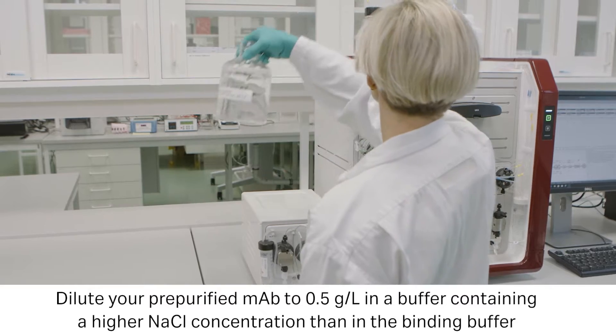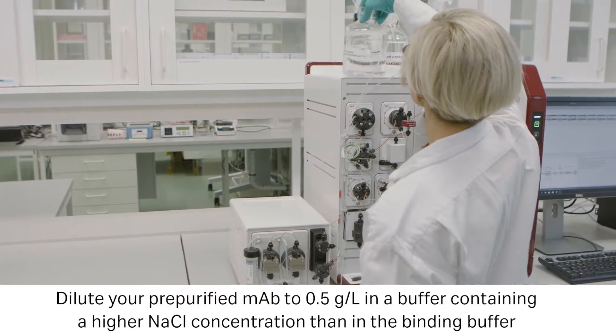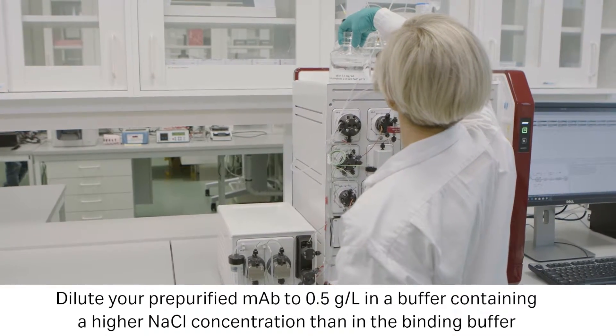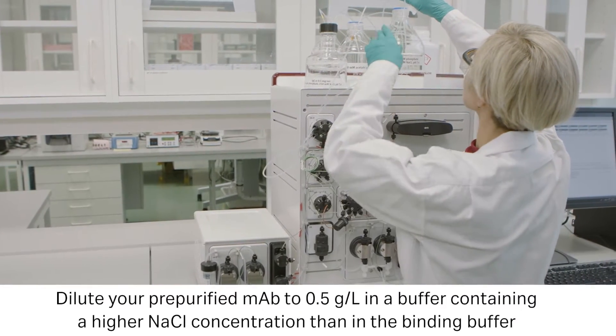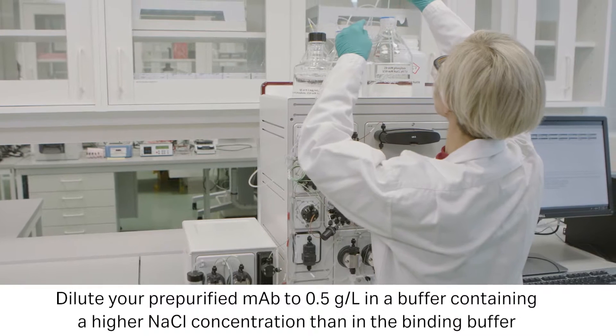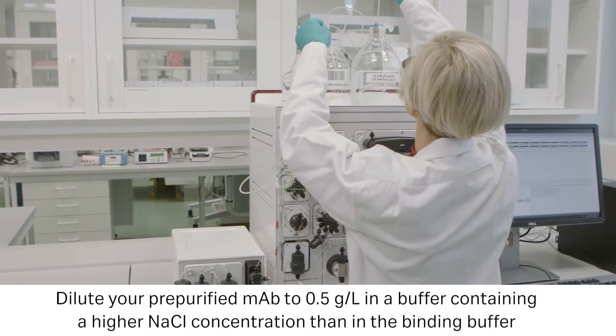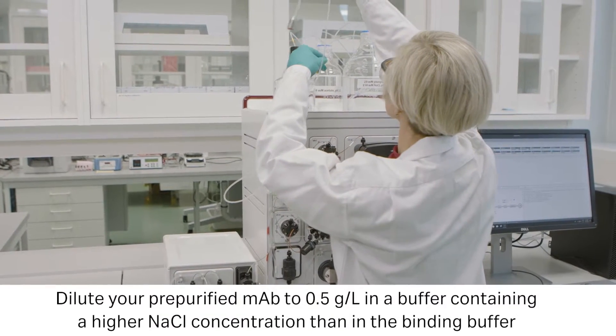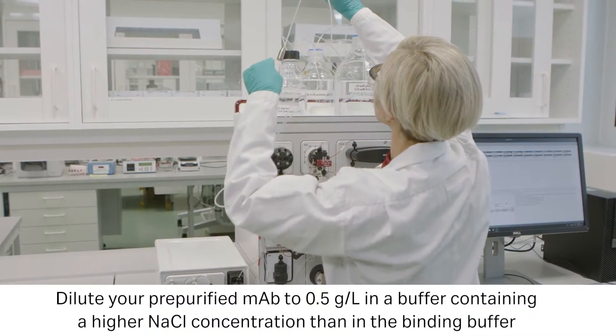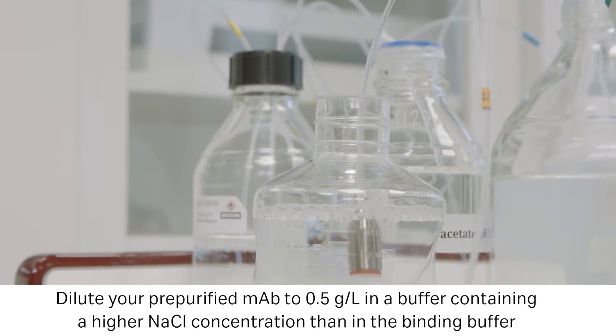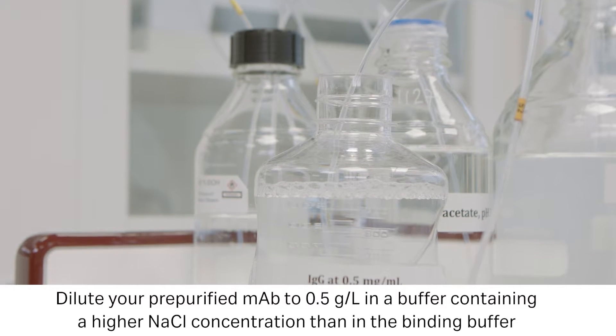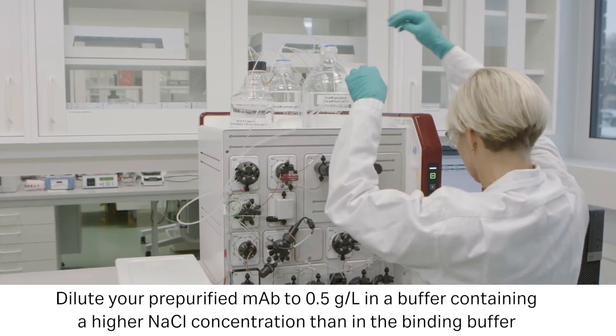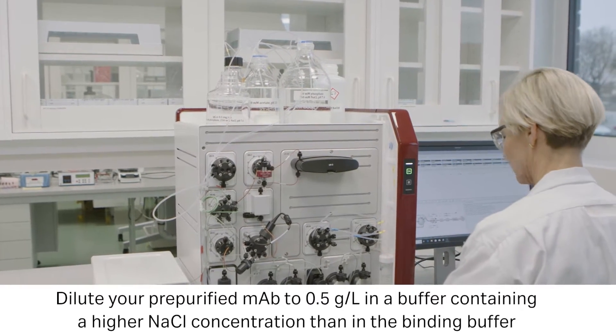By diluting the monoclonal antibody sample to the specified concentration in a buffer with a higher sodium chloride concentration, you can determine the unit's delay volume by the shift in conductivity when sample loading starts.